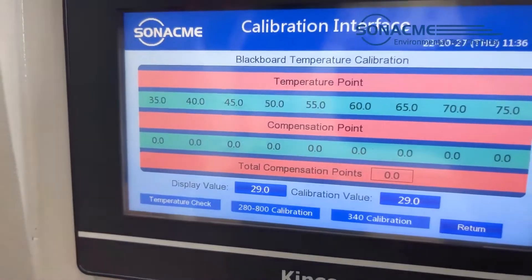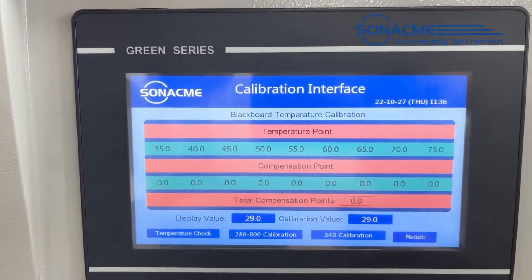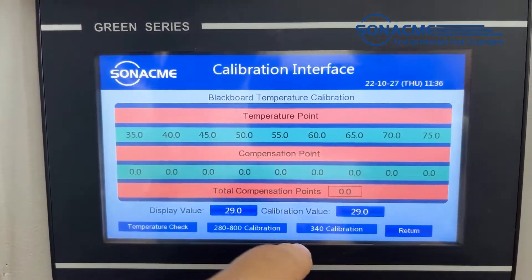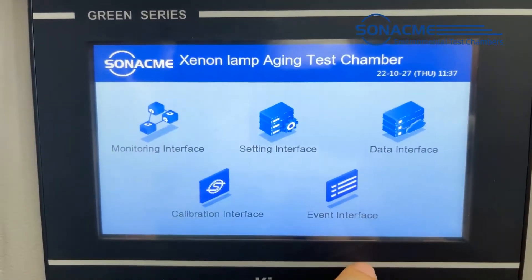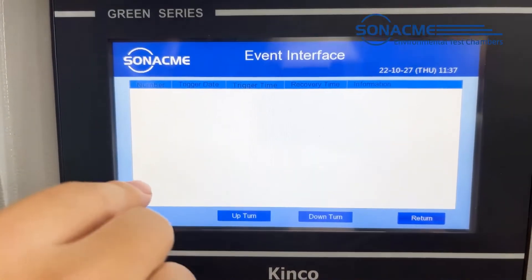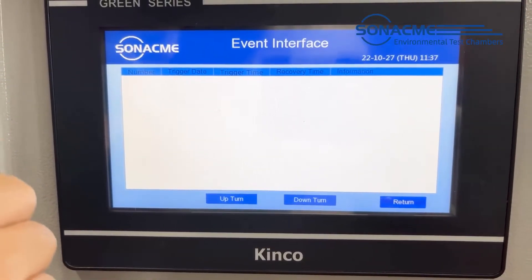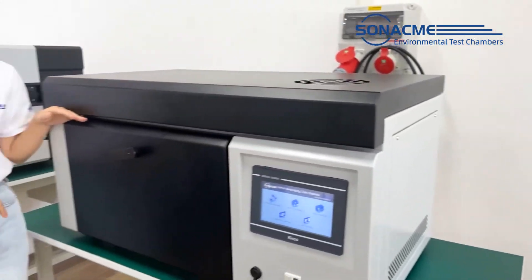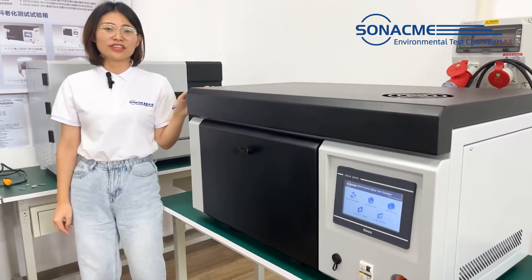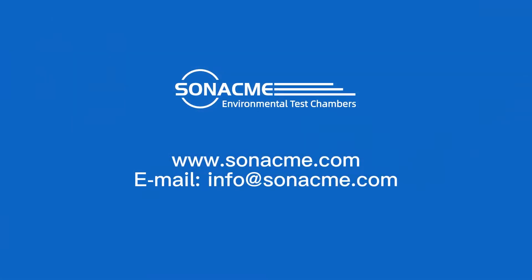The calibration interface means you need an additional irradiance meter to check the irradiance inside the chamber. It also records the alarm trigger time, reason, and recovery time. That's all the basic information for this ZLAN chamber. If you want to know more, feel free to contact us.